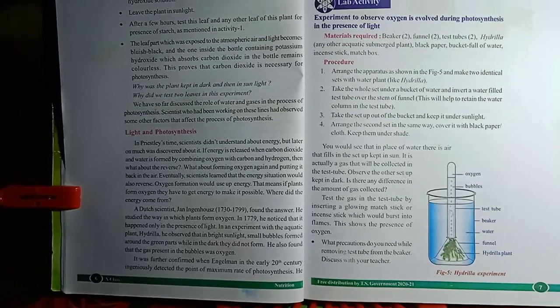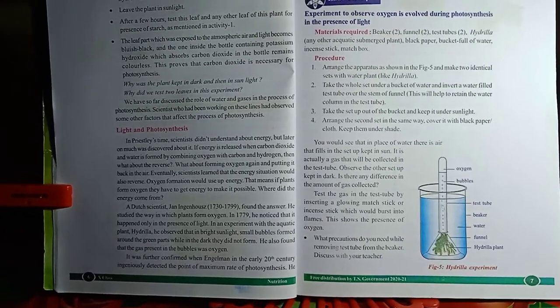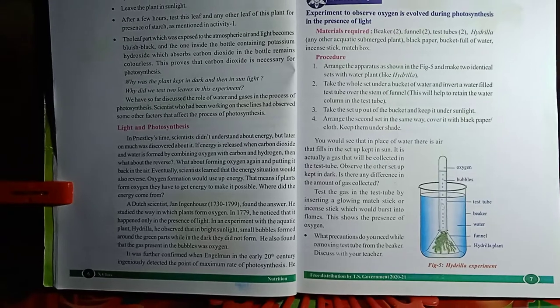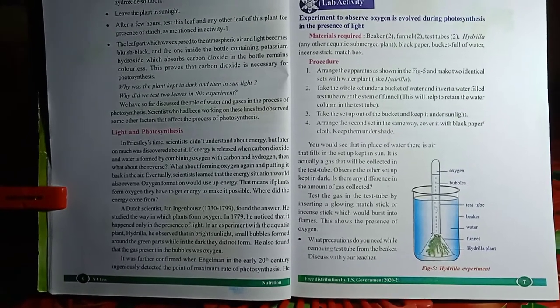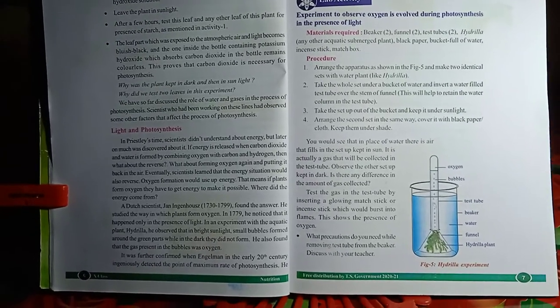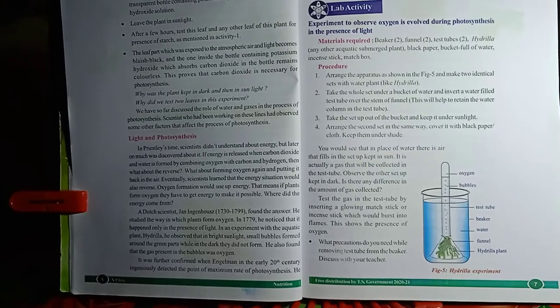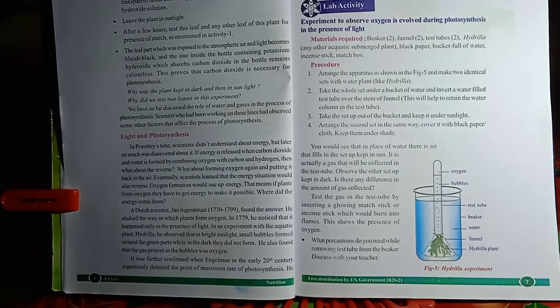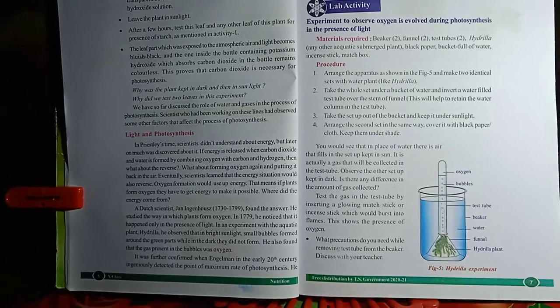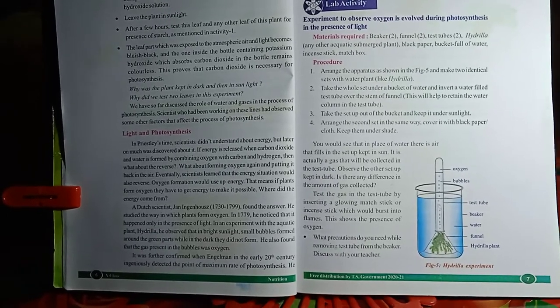After getting a sufficient amount of gas bubbles released in the test tube, we lift the test tube from the narrow end of the funnel, keeping it inverted over the water in the beaker. Then we take a burning incense stick or moss stick and introduce it into the test tube. It bursts into flames, indicating that the gas evolved during photosynthesis in the presence of sunlight is oxygen.